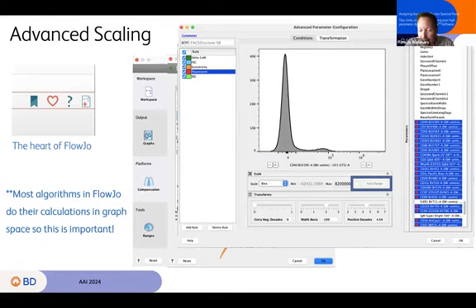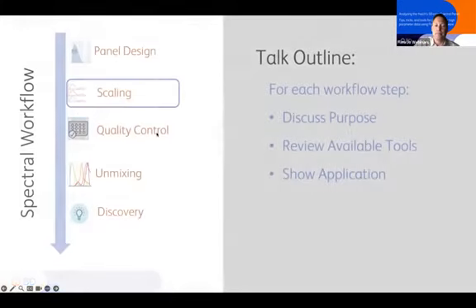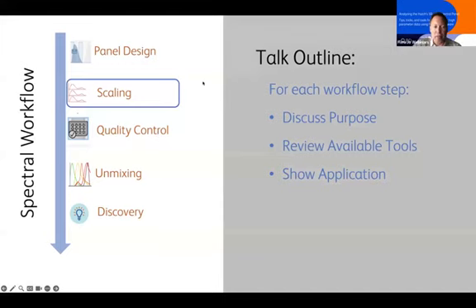So you want to be careful that the first sample in the list is not, say, an unstained or totally negative sample, so that it ends up setting a range based on just one single negative peak, which would make the rest of your data not look so good. So that is in there, but off by default. You can turn it on with the checkbox if you would like to use that. Okay, that was all I wanted to talk about scaling.